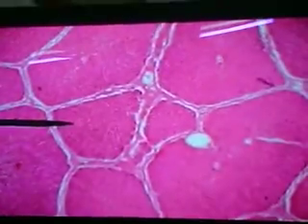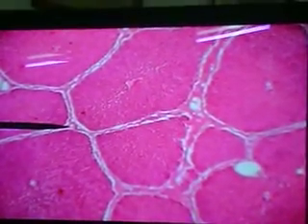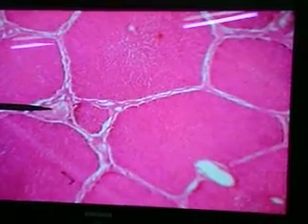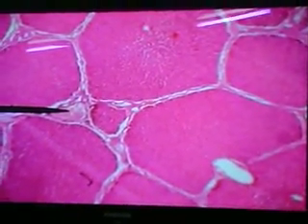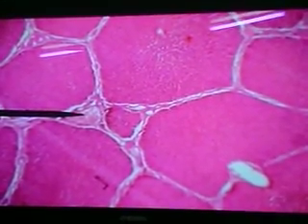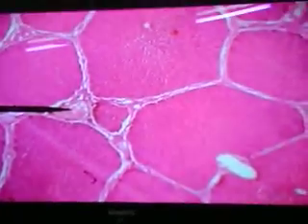But in man and in a lot of other animals, a lot of this connective tissue has disappeared, and only at the edges, only at the apices, is the connective tissue preserved. This is what is referred to as Glisson's capsule, which within the liver is now just relegated to the connective tissue that we see at the apices of the hepatic lobules.